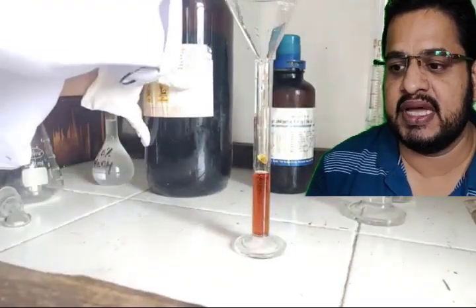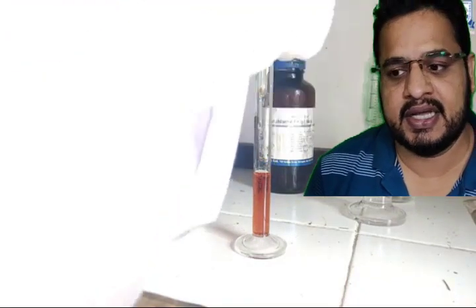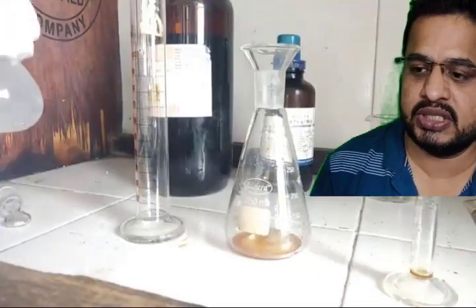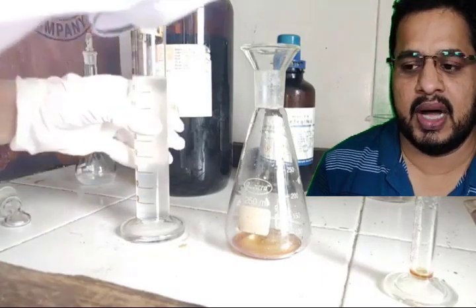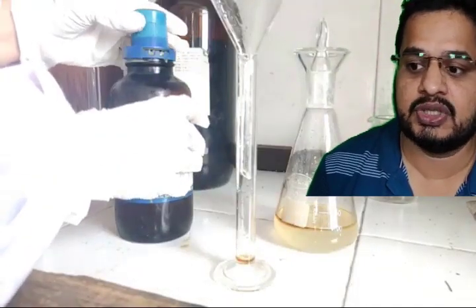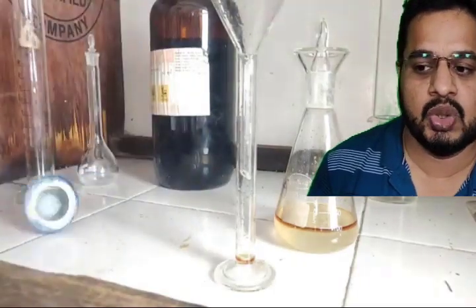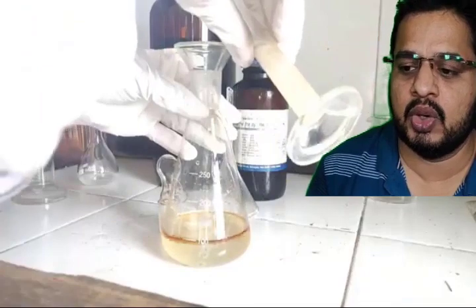Now first we will take 6 ml of aniline in the iodometric flask. In that we are going to add 90 ml of sodium hydroxide solution. This is the sodium hydroxide solution, and we are pouring it into the aniline. Now aniline is ready with the sodium hydroxide. Now this bottle is of the benzoyl chloride. We have to handle it very carefully because the fumes are carcinogenic. Now we'll take 9 ml of the benzoyl chloride, and slowly we are going to add it into this solution. Preferably we'll use the fuming hood for this reaction.